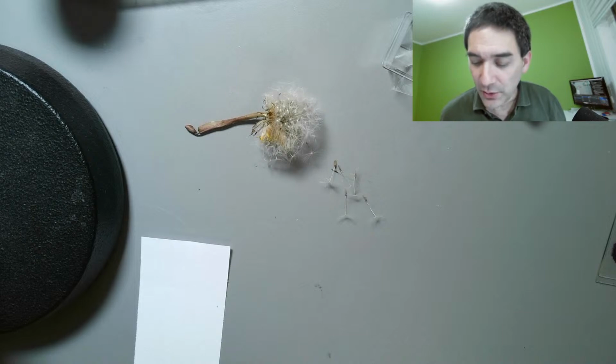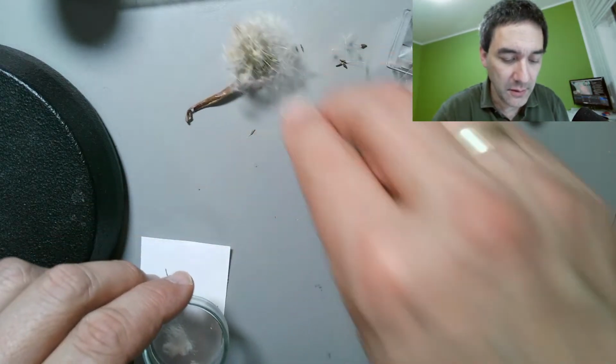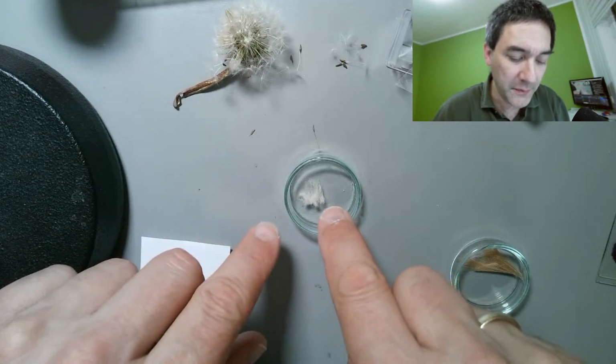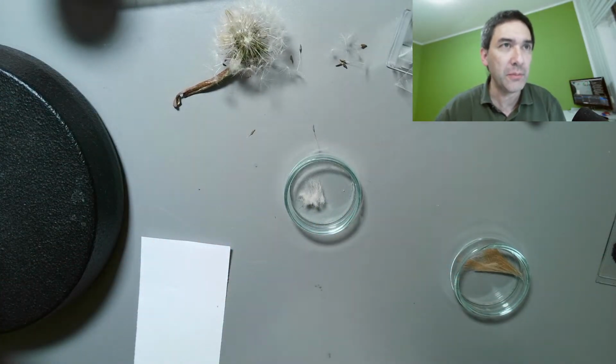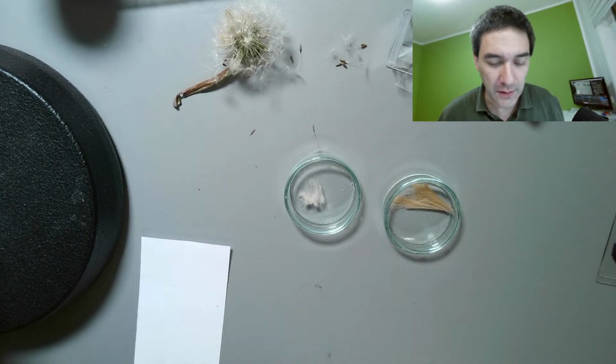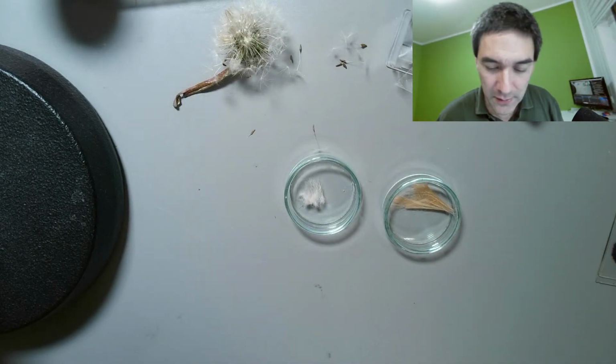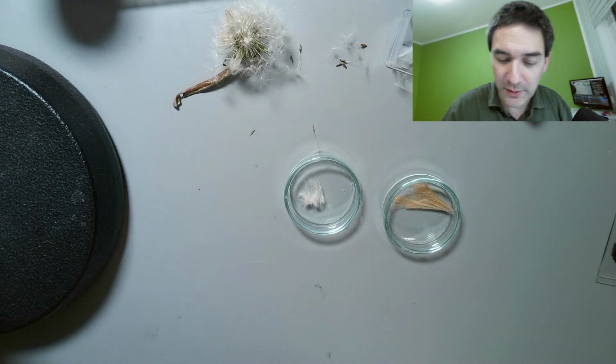So what I've got here is the fur of a sheep. I got this because we have this wool blanket, and this is from a dog, not a pet dog of mine, but the one from my mother. I would like to put those also under the microscope.